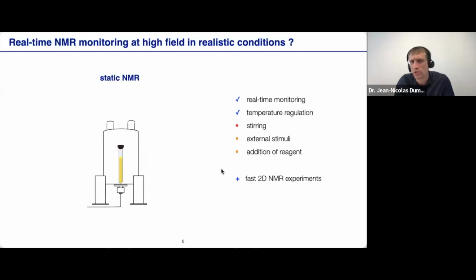It can also be harder to bring an external stimuli, such as light radiation, or to do something as simple as a dropwise addition of a reagent.